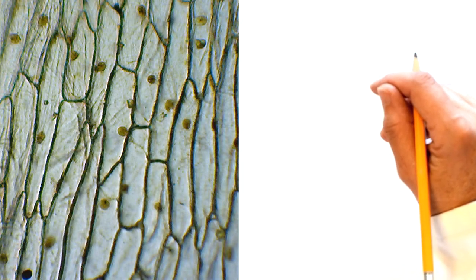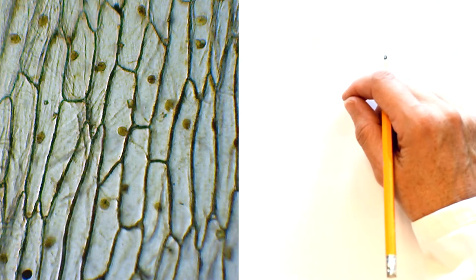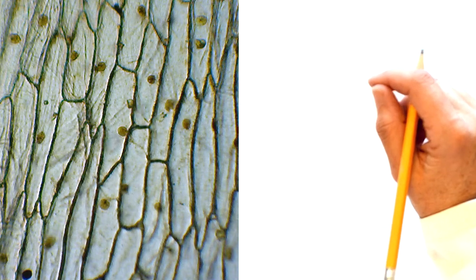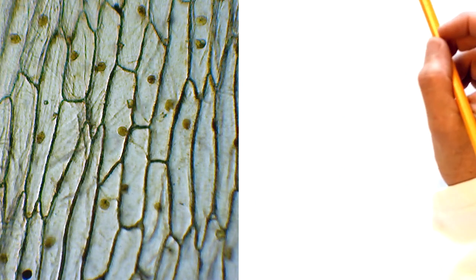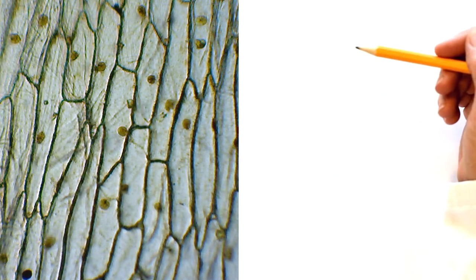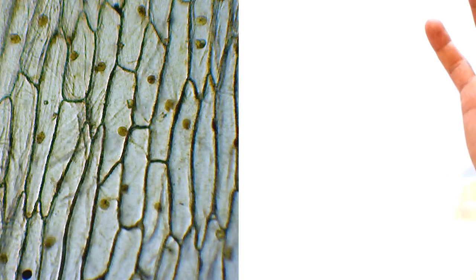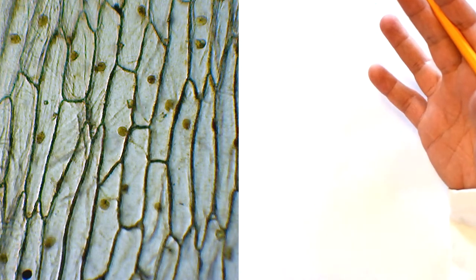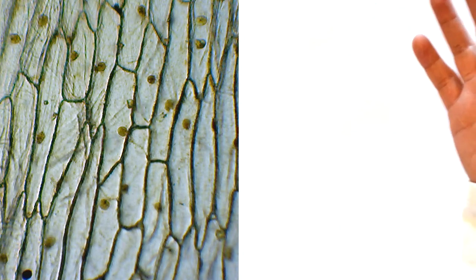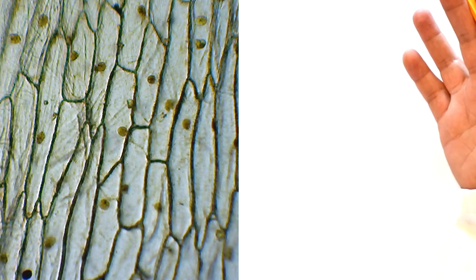So I'm going to demonstrate what I think is good biological drawing. So the first thing you need to have white paper. It's got to be white paper, you can't draw on lined paper. You need a sharp pencil, ideally an HB, and you need to think that your drawing is going to be covering at least half of the piece of paper.